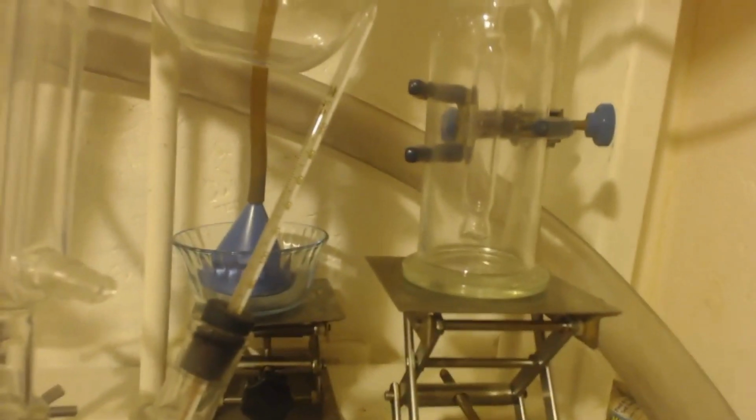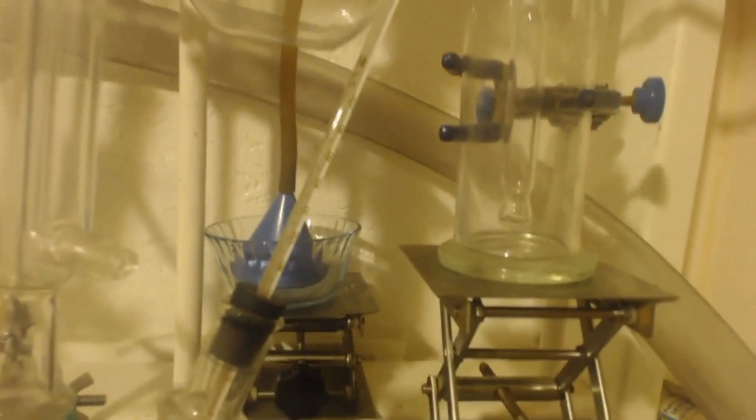And you can see there's a tube, right? I don't know if you can see. There's a tube that goes in there all the way down to the bottom. And I'll put water and sodium hydroxide in there, and it'll have to be bubbled through before it can come back out to this hose.